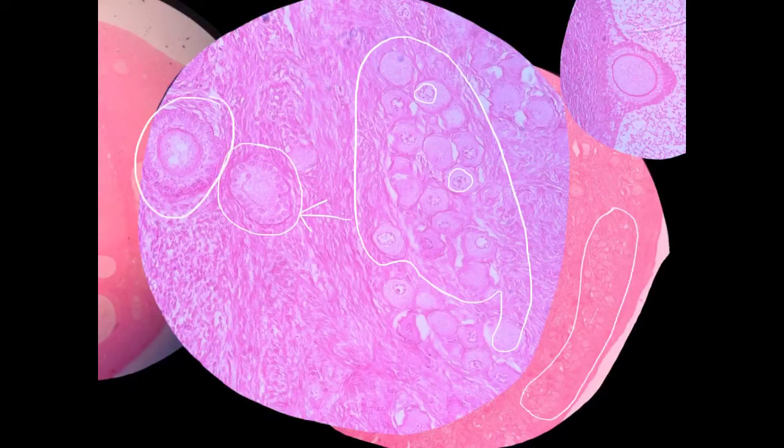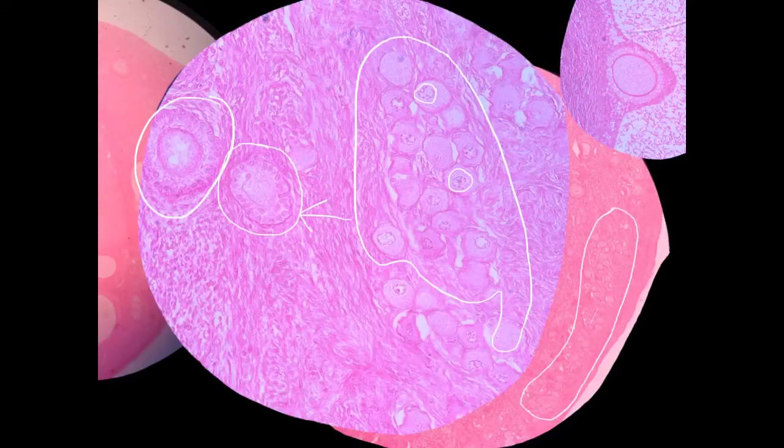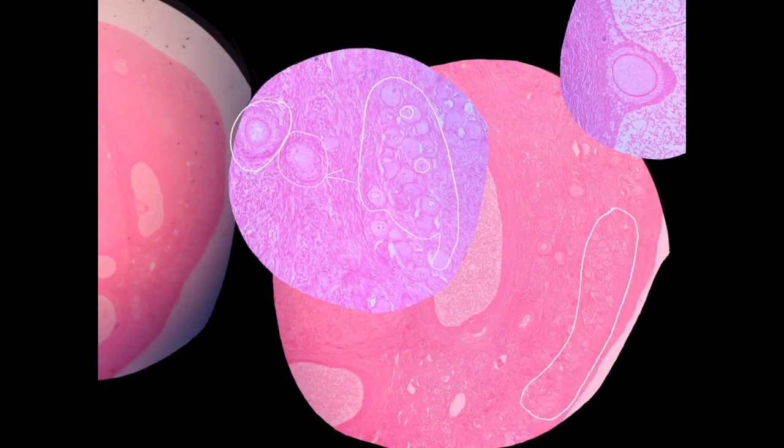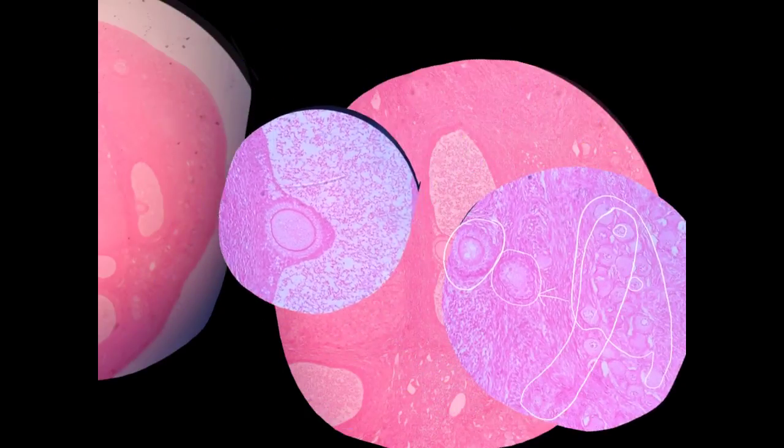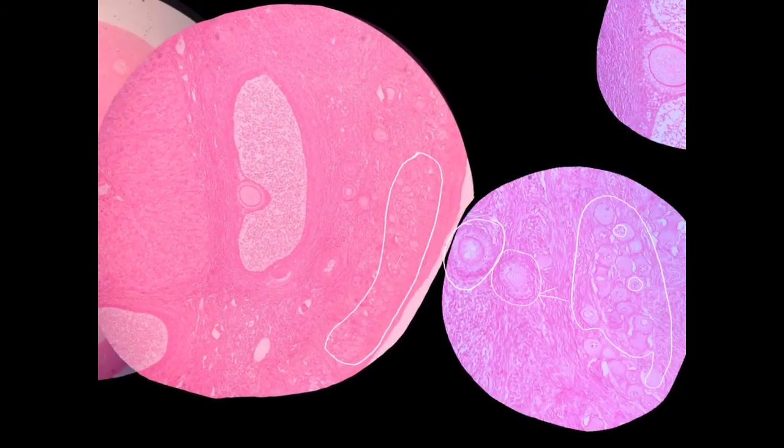This would be another example here. Then it will grow bigger and bigger. You can get multiple layers, five to maybe even 15 layers of cells, and it will still be a secondary follicle. But eventually, that turns into this big Graafian follicle we saw over here.